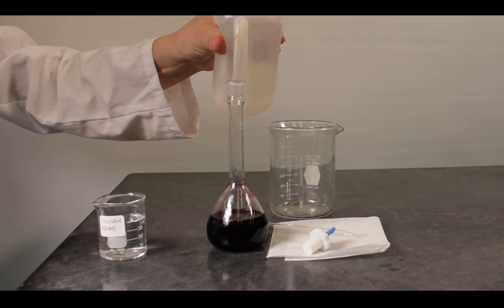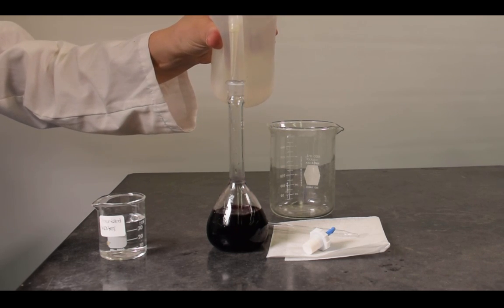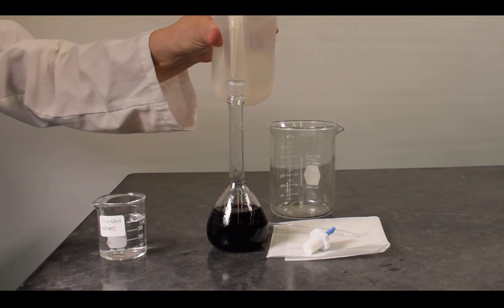Add more diluent until you are near the calibration mark. This can be done by squeezing the wash bottle directly into the flask or by pouring the diluent in using a funnel and funnel support.